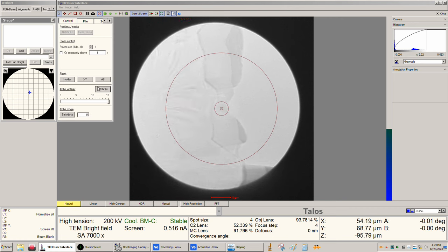And then I went back and wobbled this and showed that now, if I want to turn the wobble on here, I can adjust this until I minimize the shifting. Okay, so that looks just a smidge better, and that's really good too. Again, there's going to be some variation with this, because your eyes are going to see the image a little bit differently than mine. I can show you how to fine-tune this as well.